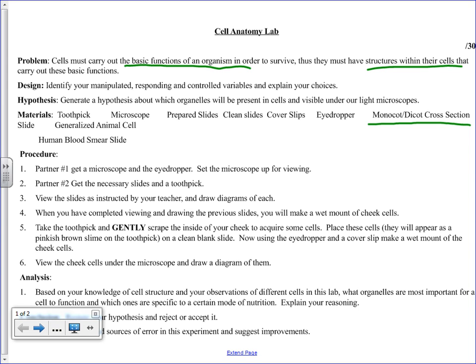You're not seeing any ribosomes, but you will see rough ER in a lot of the cells. You will see Golgi in many of the cells if you get them focused well enough. So make sure you're looking carefully at the things that we're viewing under the microscope. Get them well focused, and really pay attention when I show you the actual pictures so that you know what you're looking for.